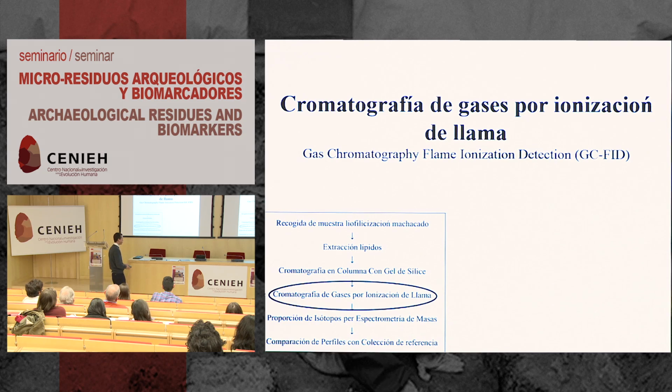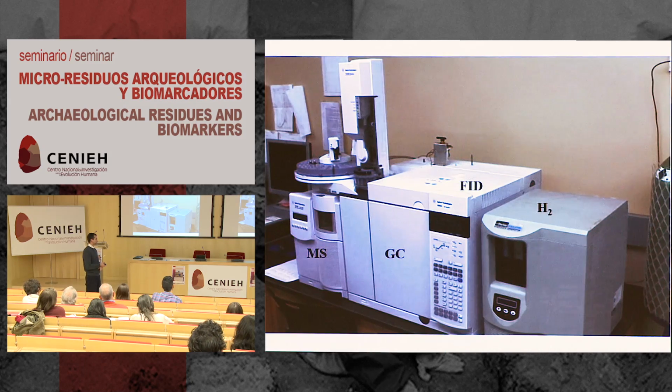Okay, so now that we've separated out our N-alkanes, we have to actually analyze them for abundance and preservation, and we do that with gas chromatography flame ionization detection. So the GC, this is a simple Agilent model GC, and up here we have our sample injector. Our sample vials fit in here, and it's all automated. It collects the vial and injects it into our oven. So here's our oven where we turn up the temperature to 300, 320 degrees. It passes through the column and the compounds get separated out on their own.